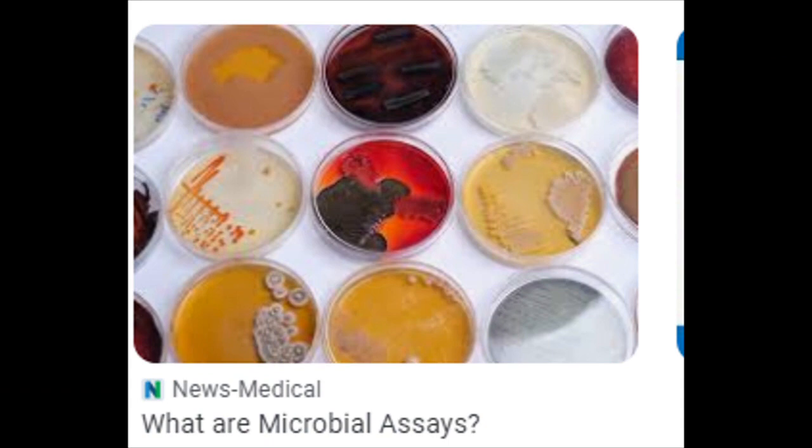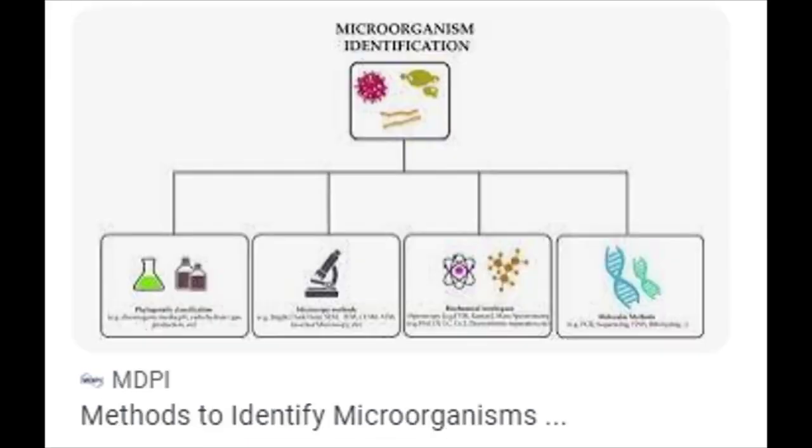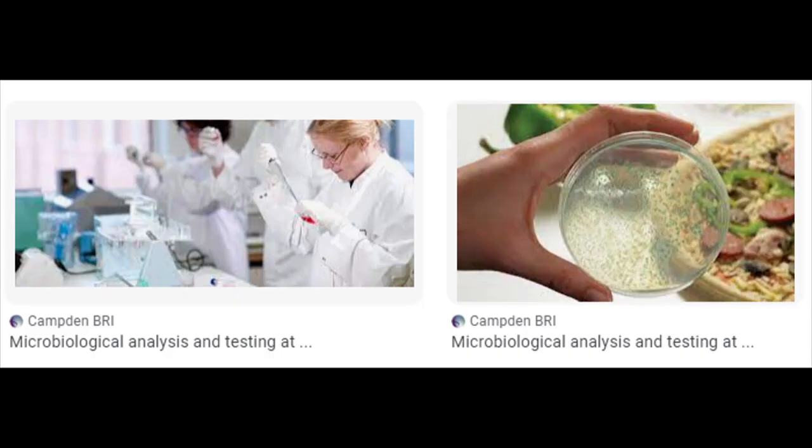That is plate count. So the colonies will develop on the plate distinctly. They will grow separately. Each of the growths is a convergence of thousands and millions of that organism in one place. So that is why you can see them on the plate. Normally, you cannot see microorganisms with the unaided eye, but in this case, it is growing in millions at a spot. So that's why it will now become visible. So you count it on the plate. We call that total plate count or plate count.